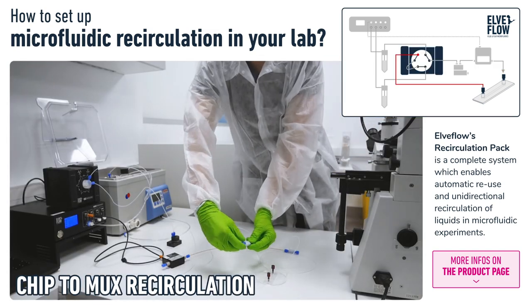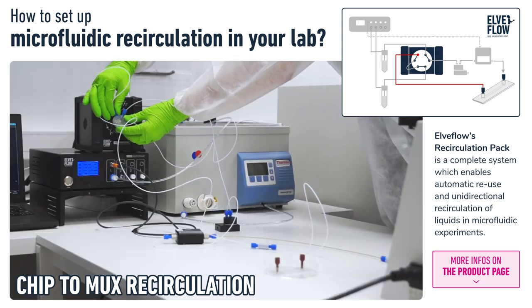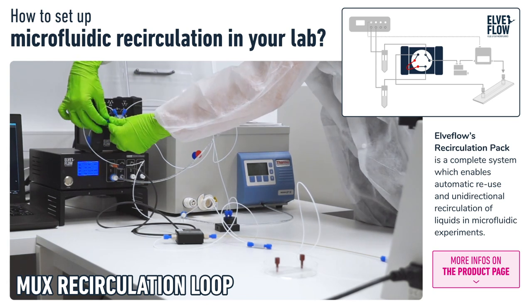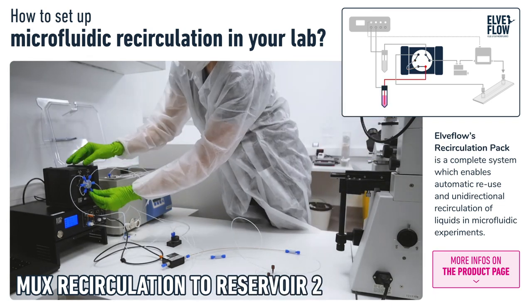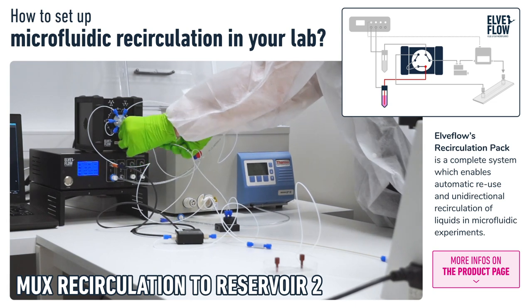Then we connect the chip back to the mux recirculation. Then we add a loop piece between two consecutive mux recirculation ports, and we complete the circuit by connecting the mux recirculation back to Reservoir 2.